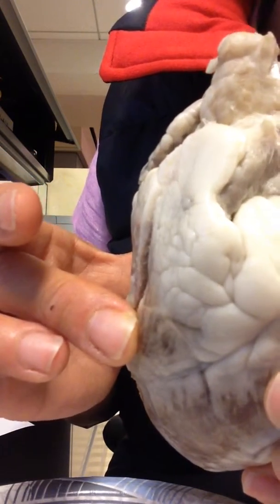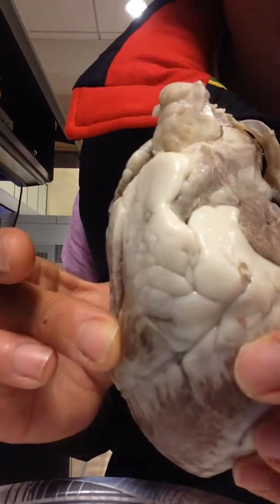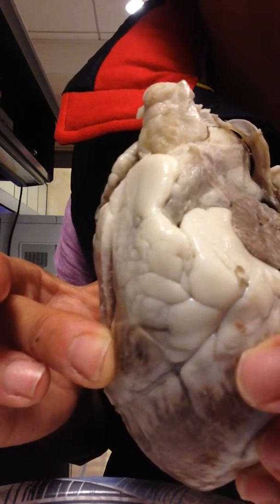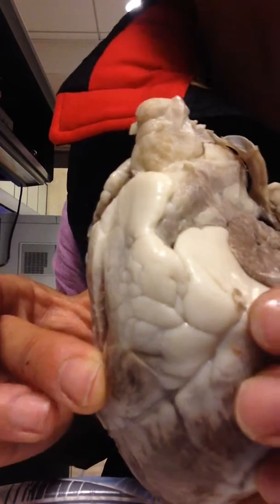And then, let's see. So the question under that one is: is the blood in the right atrium oxygenated or deoxygenated? So in that right atrium, it is deoxygenated. And the blood in the left atrium is oxygenated.